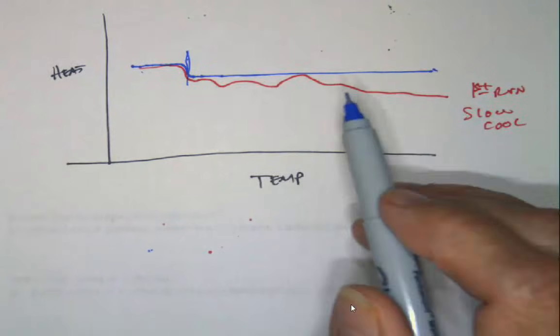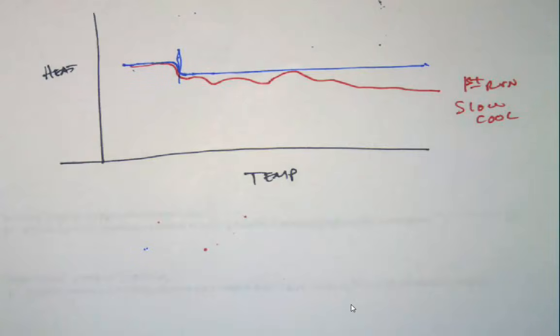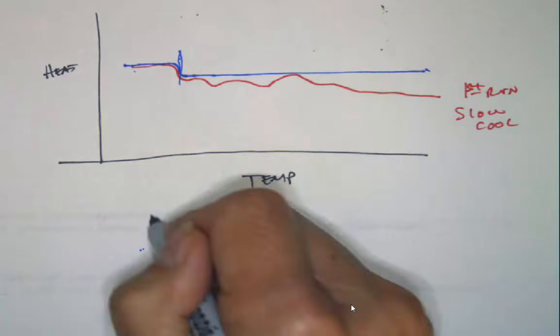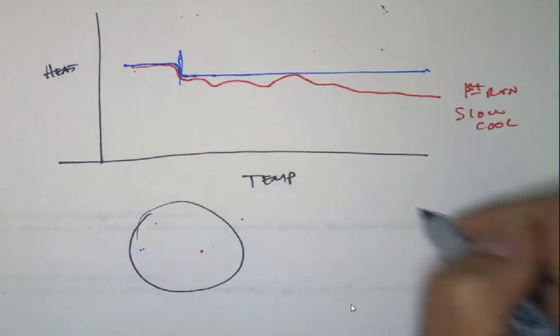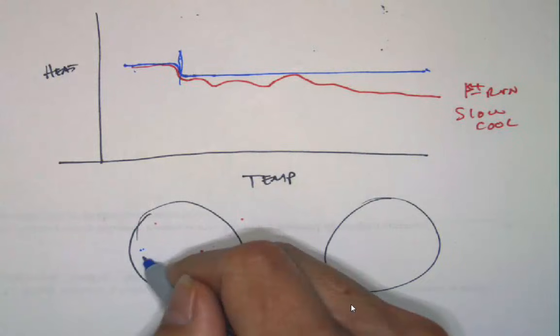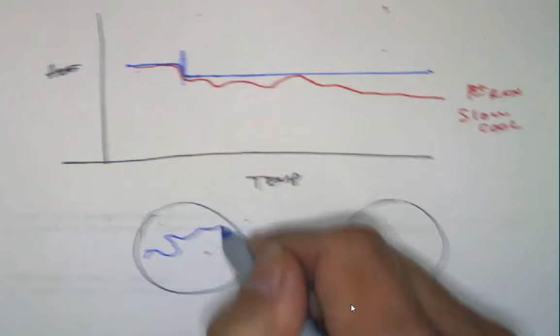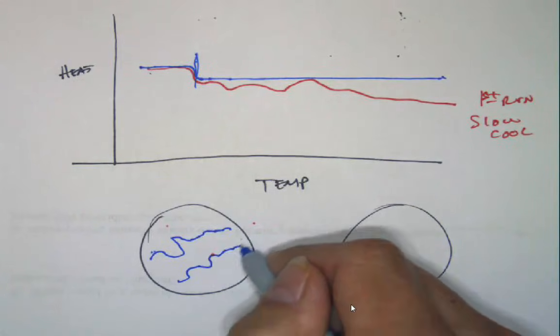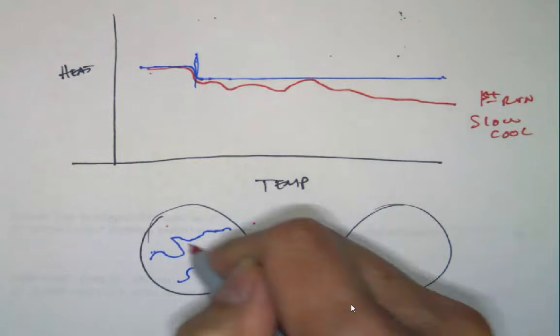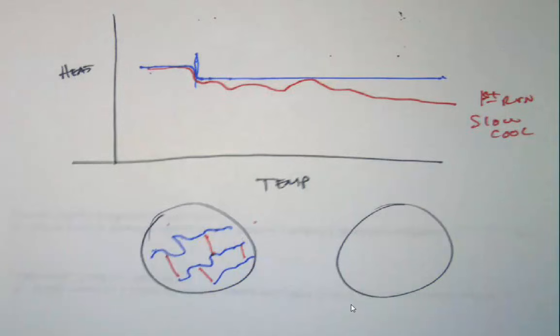Understand that this instrument is able to detect conformational energy of the molecules. Crystalline conformation is a big energy generator. But if you had a microscope that would let you see the molecules, going into the first run, you could have literally had conformational energy. This could be a thermoset where you have cross-links locking these molecules together.